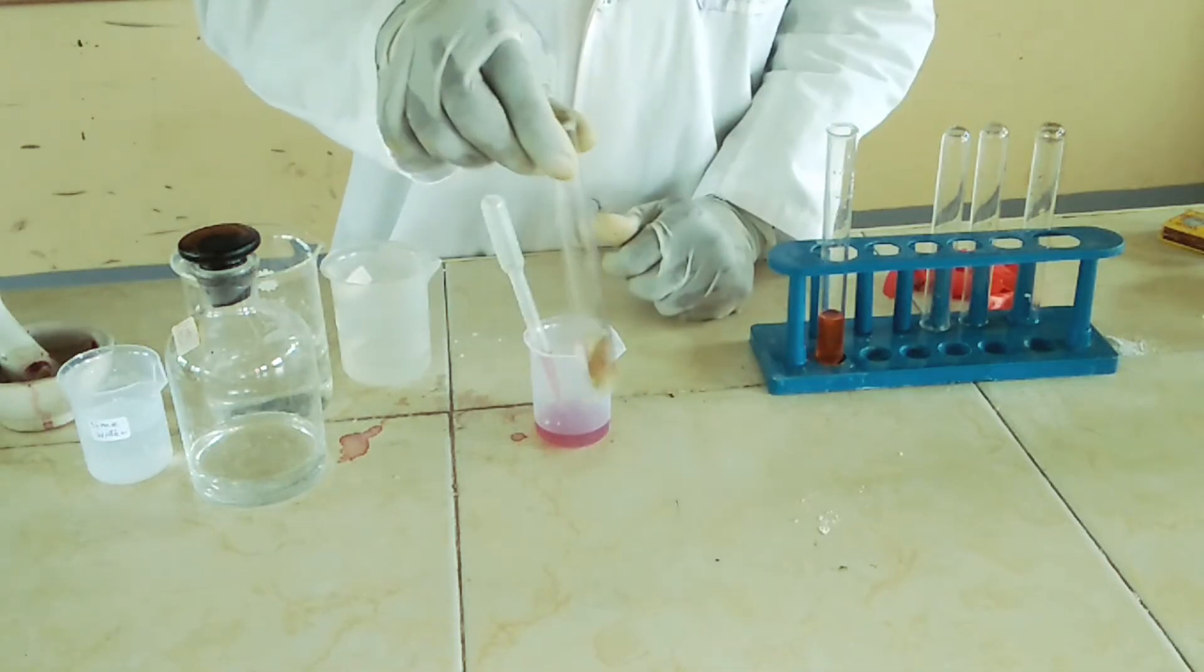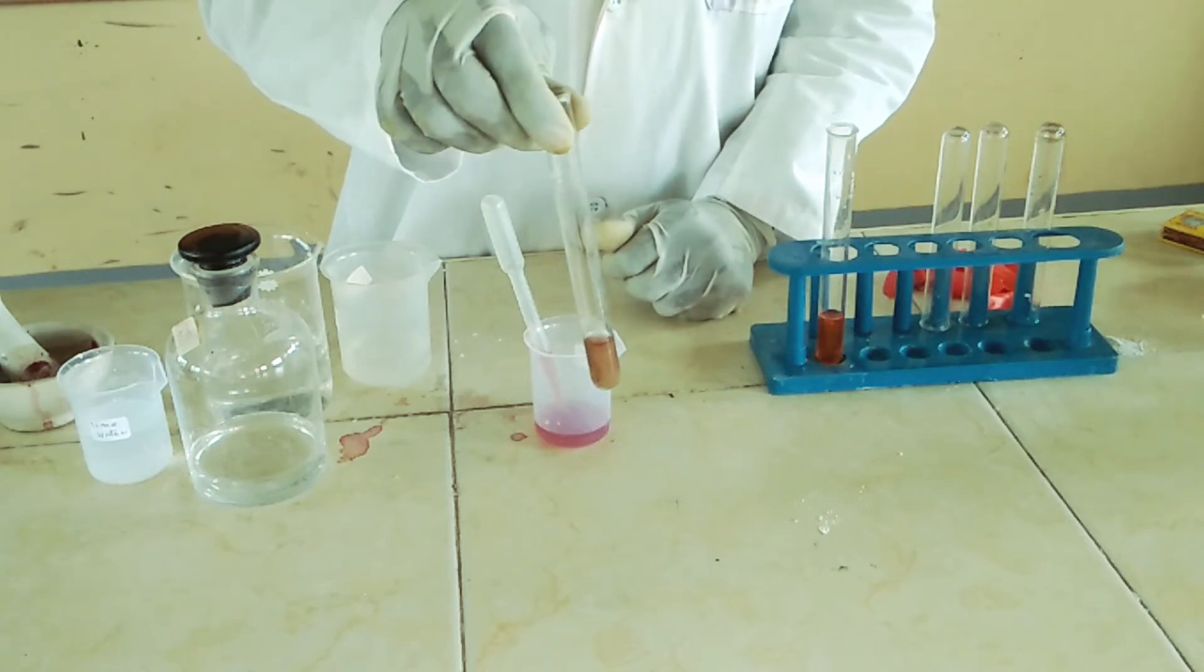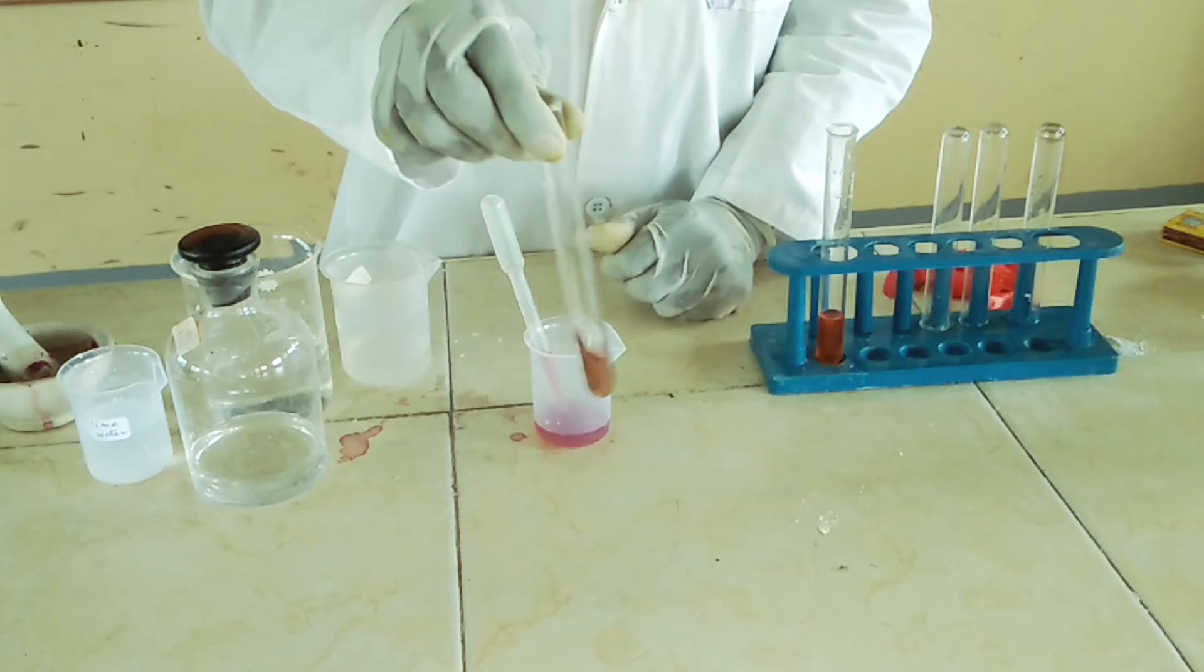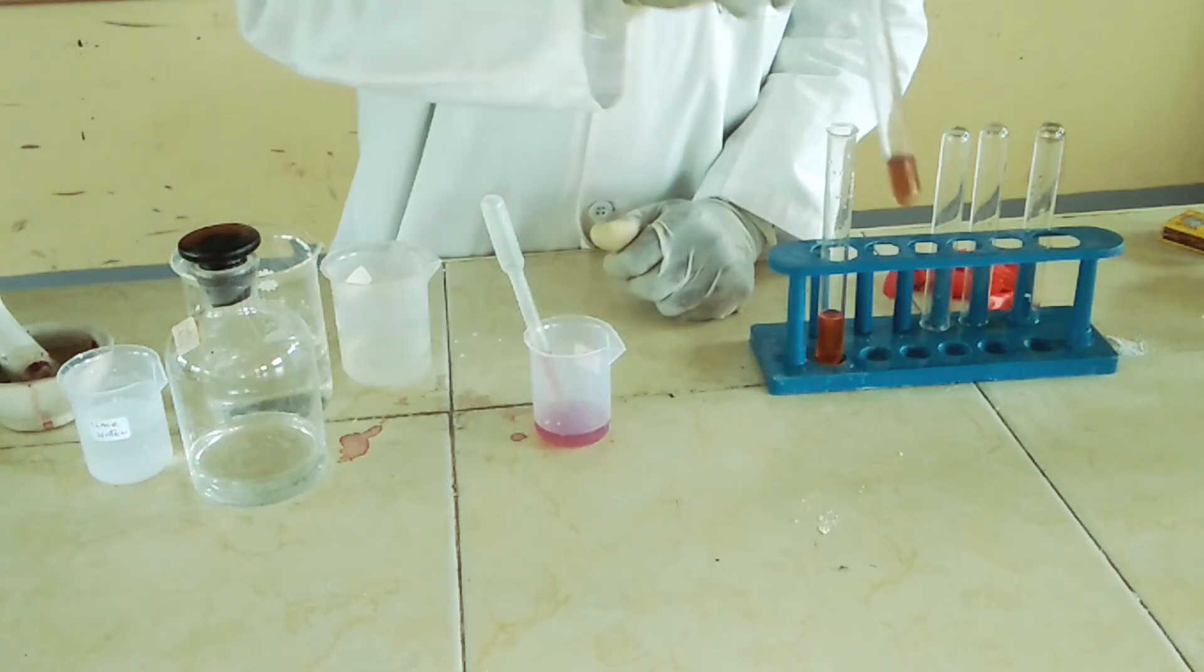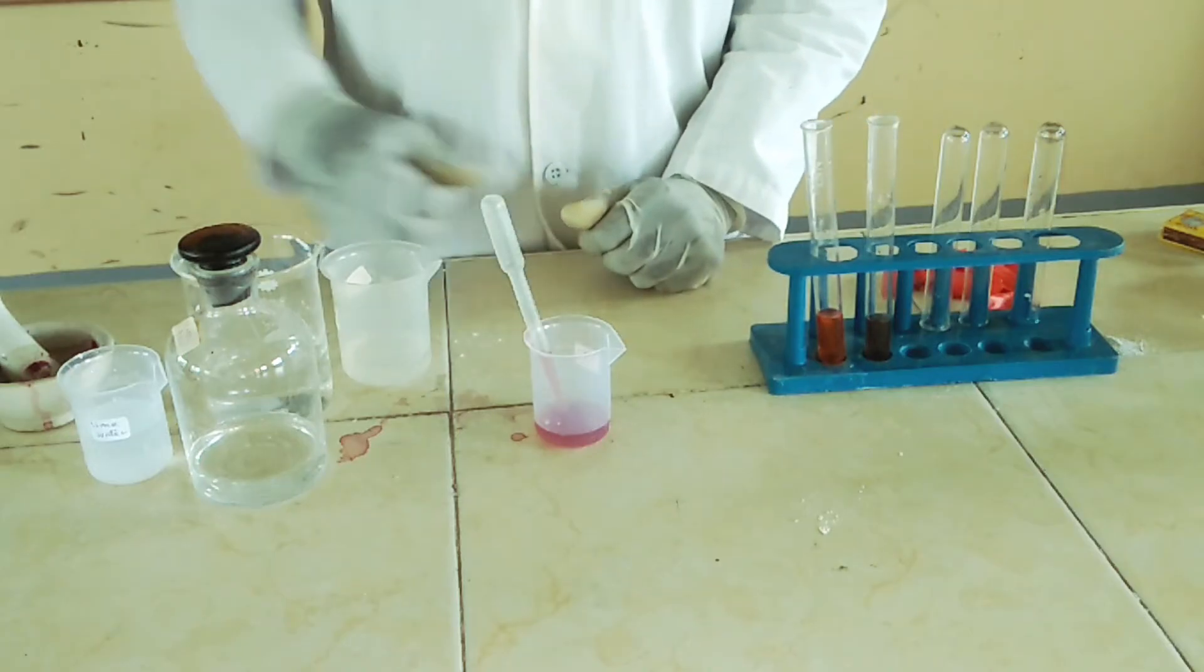Then I'm also going to add a few drops of the indicator and shake. So I'm getting a brown color that is almost green for our test. It's giving a different color from that which was given in an acid.